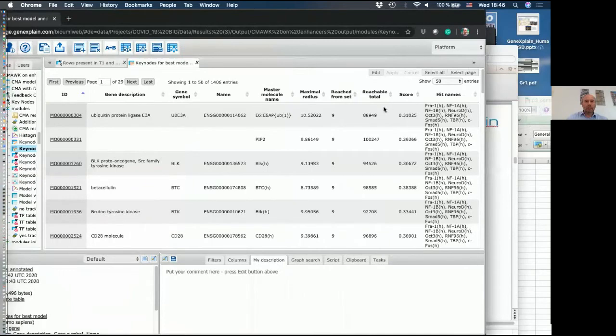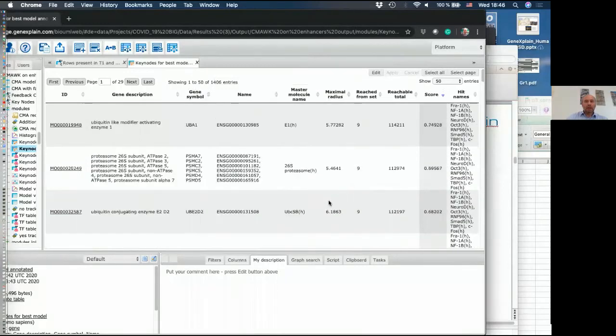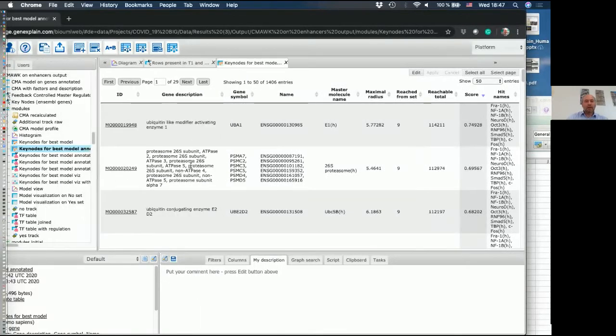So it calculates the scores, which is, as I said, a combination of the sensitivity and specificity. Actually, this table doesn't show the p-value, so to get it, you have to apply a special filter. But it also can calculate these p-values, and it takes them into account in filtering.